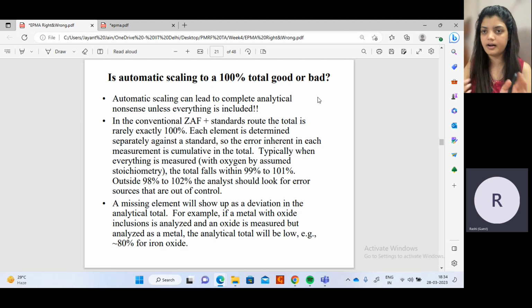That's all. I don't care how much percent is present. I just want each and every signal you are coming across to be included, which element it is from and how much it is present. You just tell me. That's it. Or we need it in the EDAX.